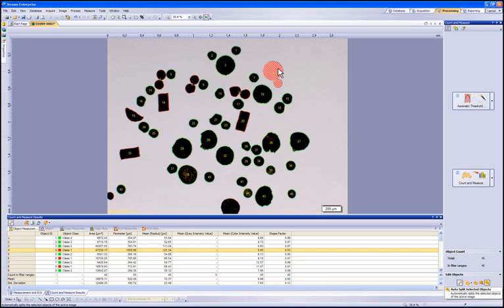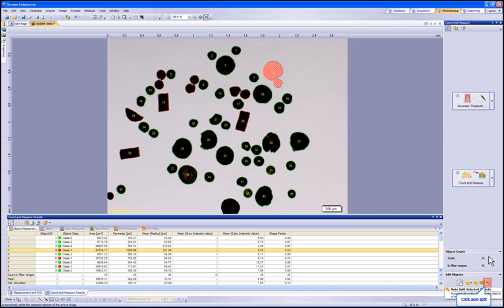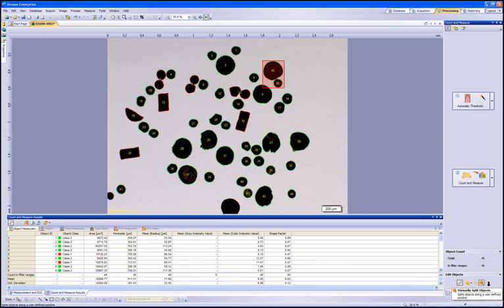Now let's select a particle that is touching and has been counted as one large particle. We now need to decide to either manually split the particle by drawing a borderline between them by hand, or to select the Auto Split option within the software. Let's try the Auto Split option since the particle can be easily determined as two particles based on its shape.